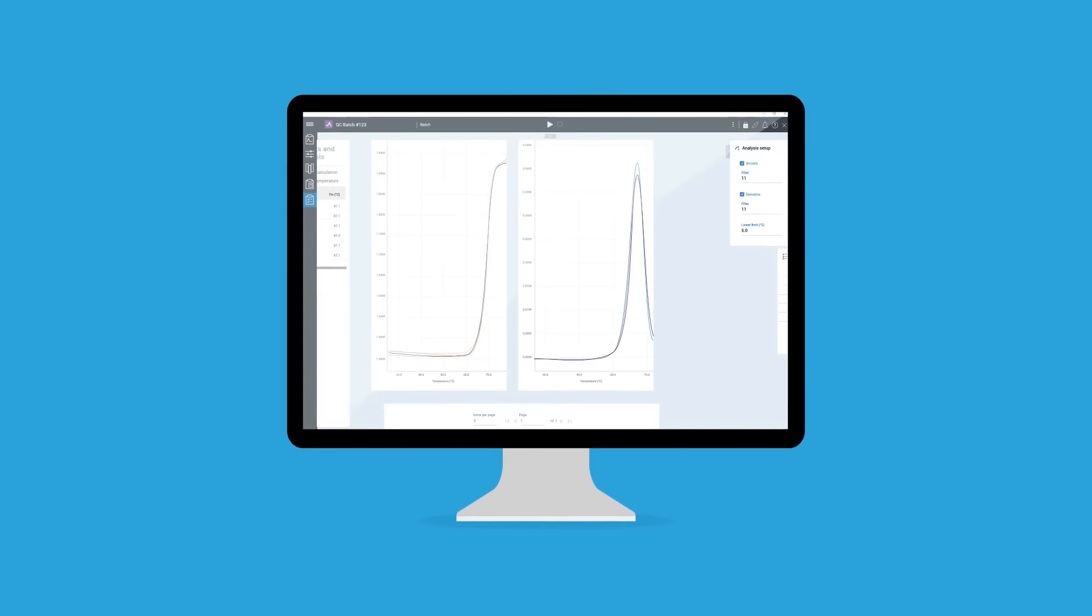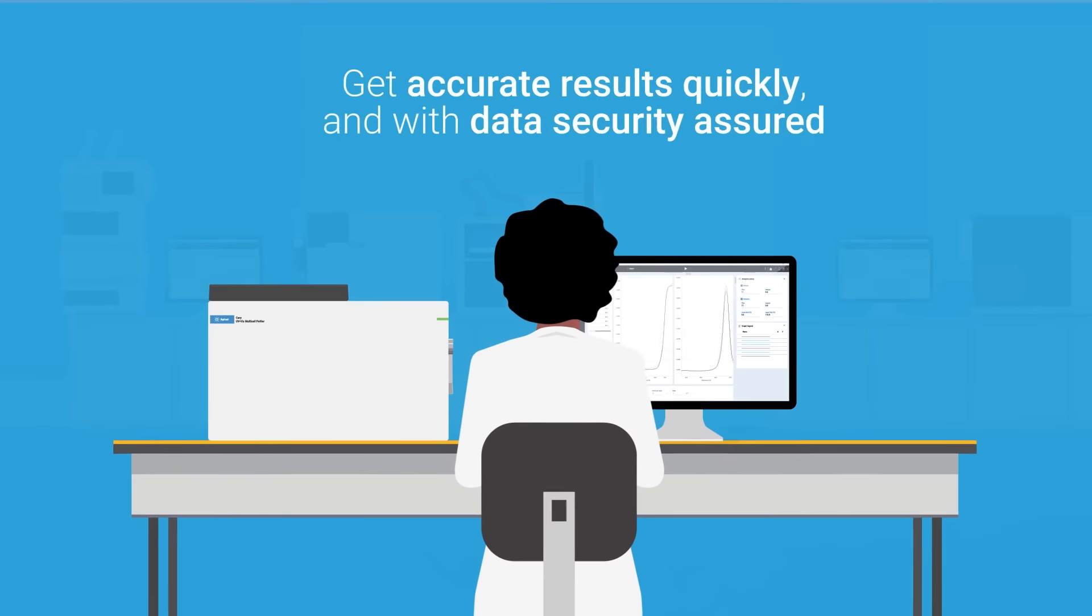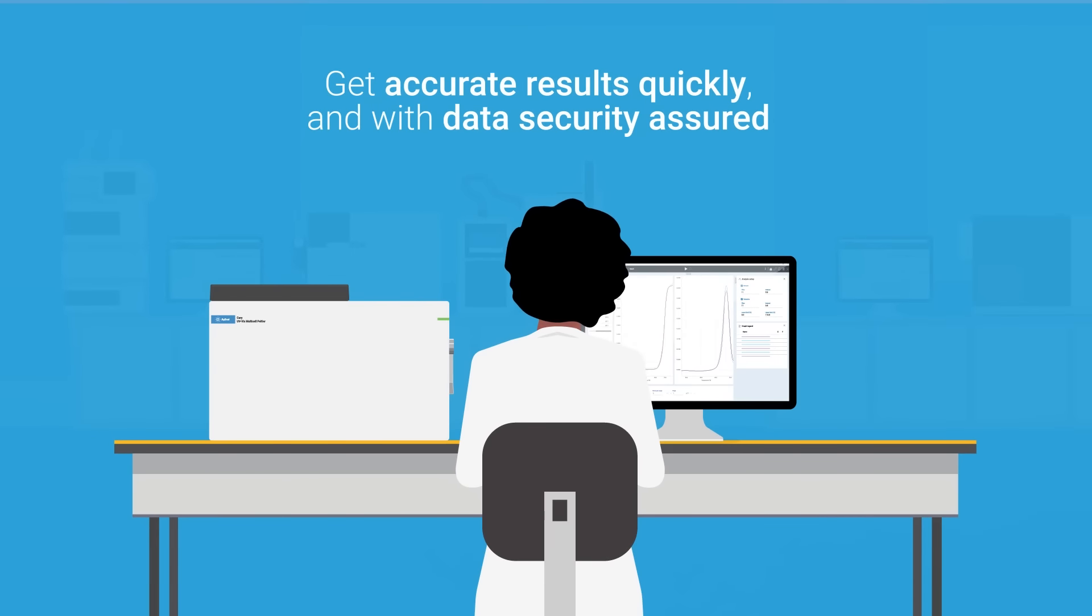Straightforward data output, built-in calculations for data analysis, and data protection mean Alice can get results quickly, with her data security assured.